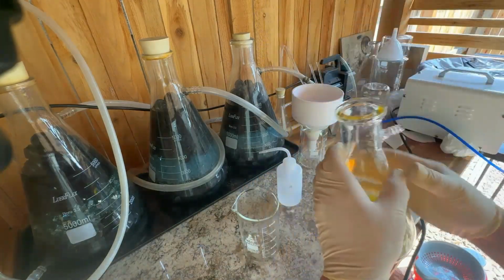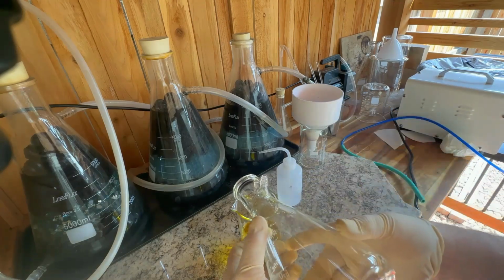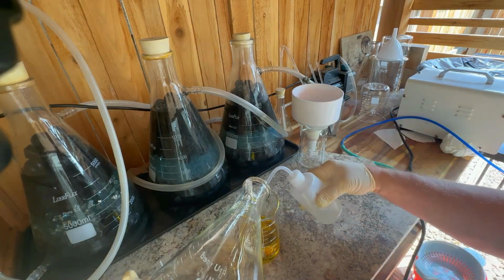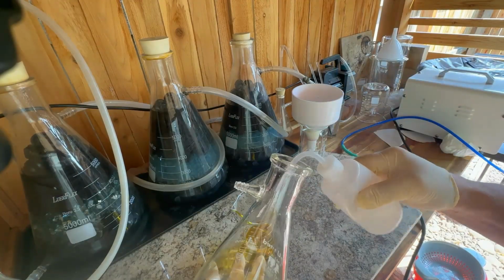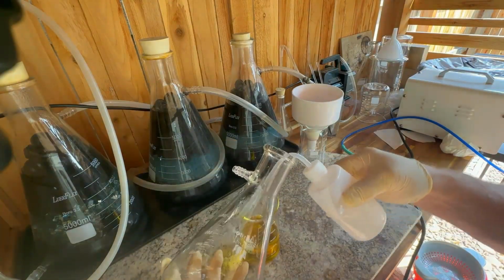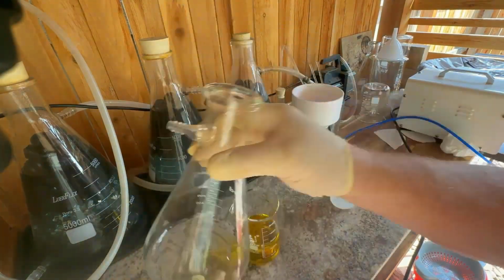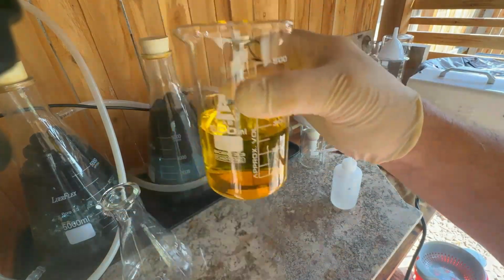And I hope you can see, especially as I transfer over here to the beaker, just how much clearer the second filtration is than the first. The first didn't look horrible, but the second one is just crystal clear. You can see perfectly through that solution.